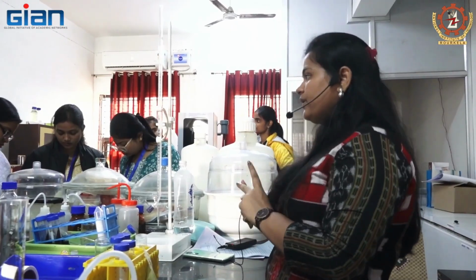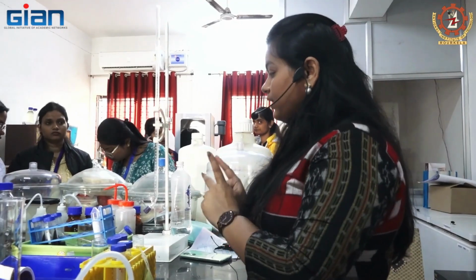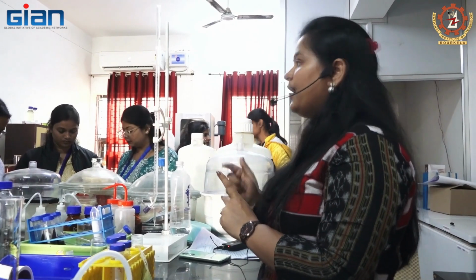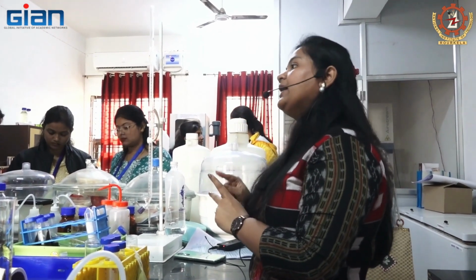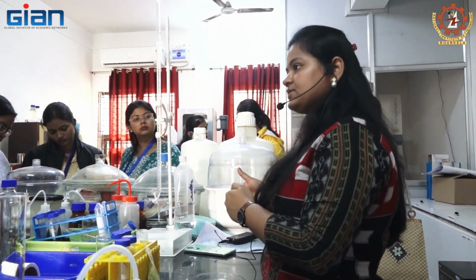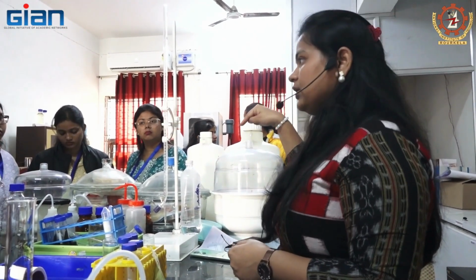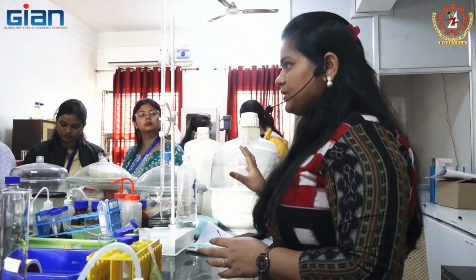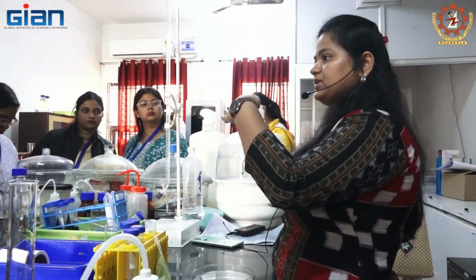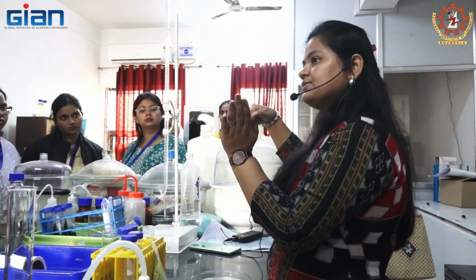Dipole rotation, what is meant by it? When we give the microwave to the food samples, due to the oscillating electrical and electromagnetic fields, the polar compounds, polar meaning hydrogen, oxygen, all these compounds, will be aligned proportional to the oscillating fields. Got it? Suppose this is the sine curve. Like a sine curve, the electromagnetic field is given. When it is in the upward field, the polar compounds align like this. Okay. Then when it is the downward field, the polar is this. Okay.